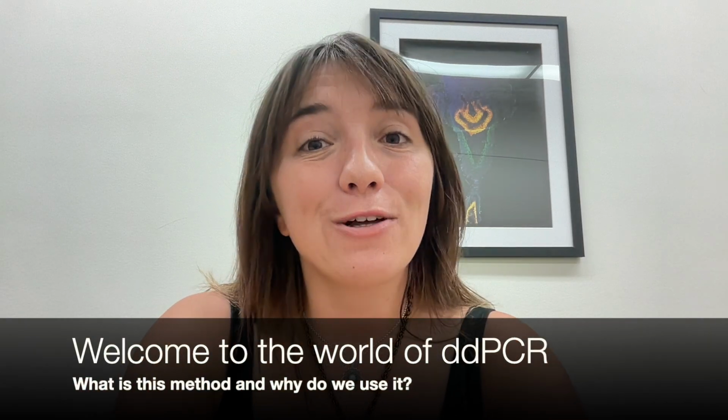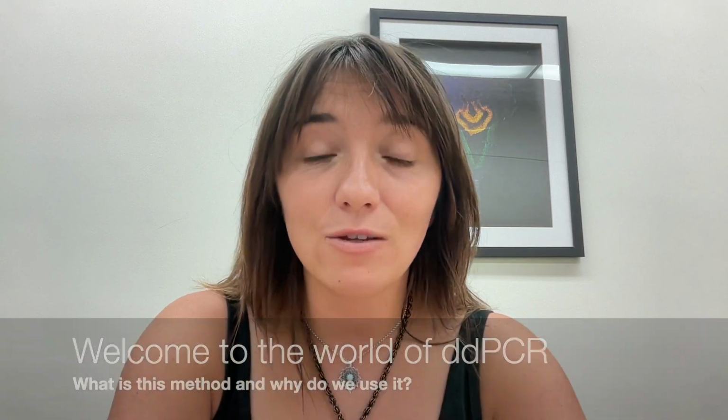My name is Dr. Chloe Puyu, and today we are diving into the world of droplet digital PCR, or ddPCR. This video is going to go step by step, all the way from calculating reagent concentrations through to interpreting results from our real lab data live.